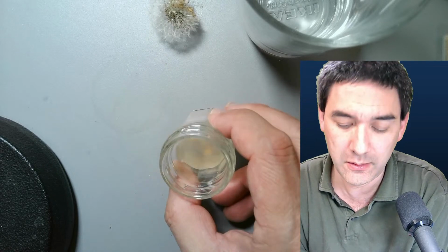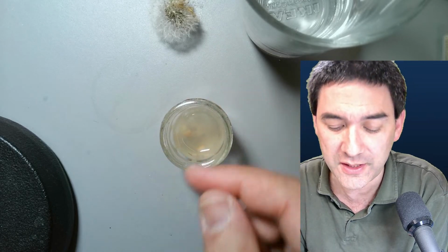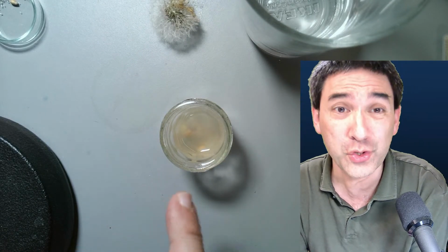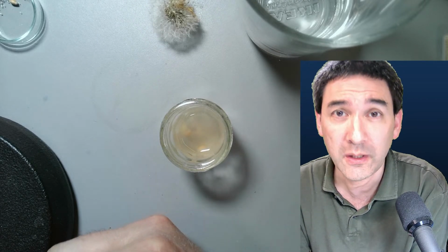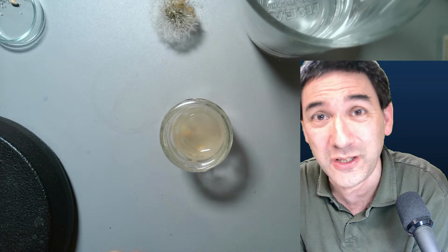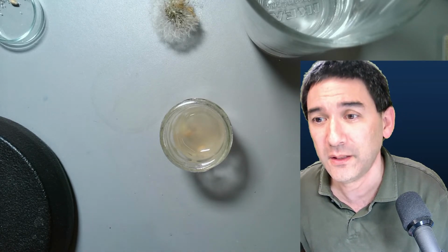There are a lot of bacteria in here, and you don't know which ones, so you need a healthy respect. I would not touch this with my fingers. I wouldn't automatically assume that they are dangerous, but the concentration of bacteria is quite high. If you ask me whether it's dangerous to keep it in your room, it's a little like asking how dangerous it is to keep food in your room which starts to decompose and rot. It's also not healthy, so I would consider this at a similar level.